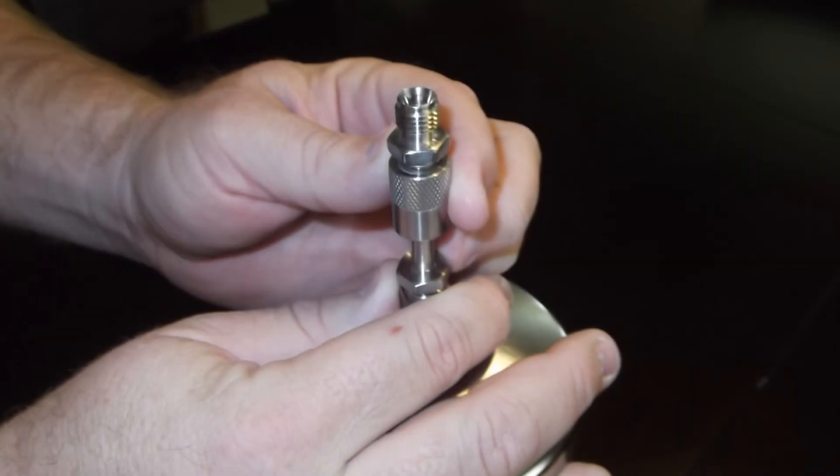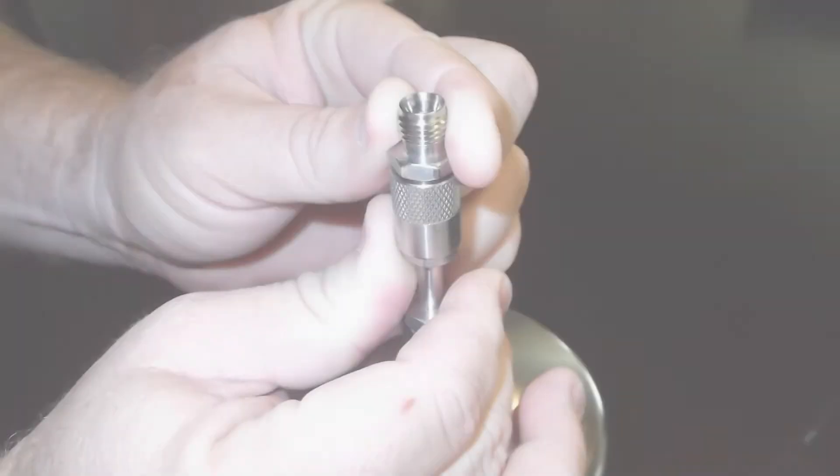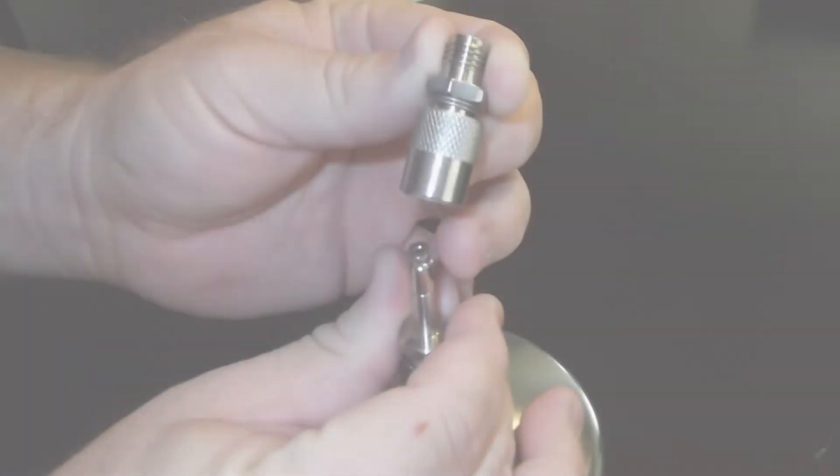Now, remove the grab sample adapter by again pulling the metal sleeve towards the nut and removing it from the minican.